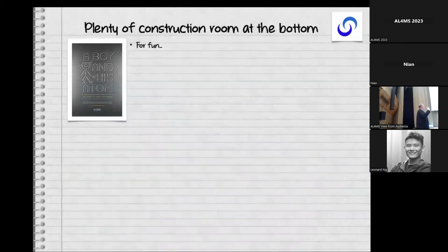Atomic manipulation has, of course, been done a lot before, very famously in many cases. This is the cool video from IBM, where they actually had a professional director, and this is a boy playing with his atom. I strongly recommend watching it. I guess it's not taxpayers' money being wasted, it's corporation money being wasted, but it's extremely fun.